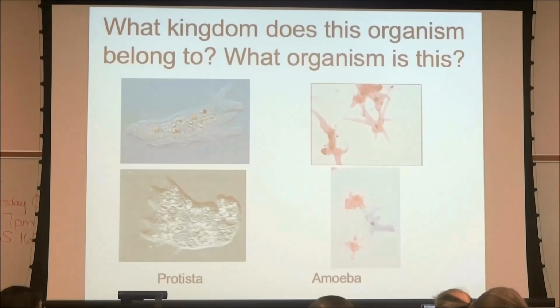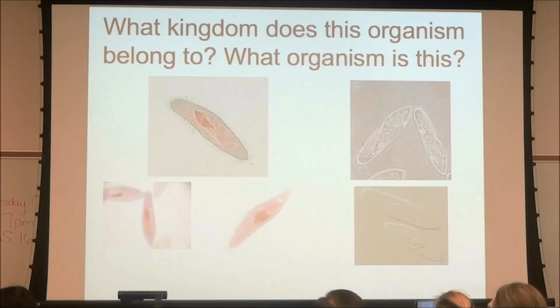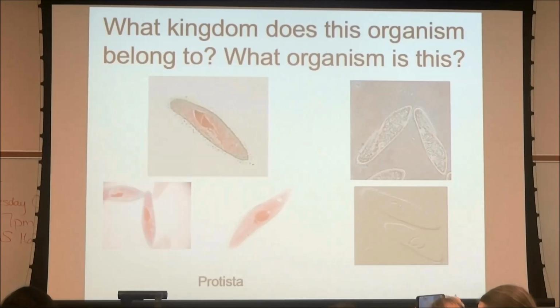Alright, you guys okay if I switch? Alright, what's this? Oh, close, yeah. Parameciums. These are the paramecium. Here, there's mine. Sorry, it's being delayed. The paramecium will pop up on the bottom there. So this is the paramecium. How did you know? Shape. The shape is oval. Okay, what else? Little leaves. Ah, the cilia. Yes, you can see the cilia. What else?